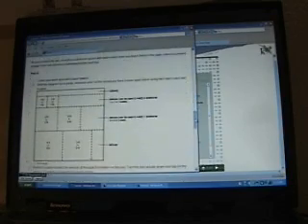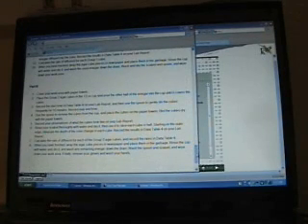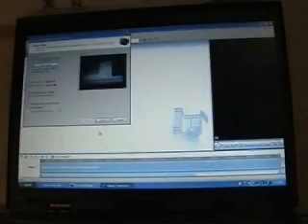And then what you're going to want to do here is access the student guide. Now the student guide is going to have all the information that you need right in one area. It's going to give you the goal for the lesson. There's the advanced prep, which you should have hopefully completed. If not, you have it printed off here. There's all the materials that you're going to need, and we're going to cover that in a minute. Safety warnings, procedures. There's the sample diagram of what your block is going to look like and how to cut it up, and then it's going to actually go over and explain what the actual experiment is. I've already printed that off, and that's where we're going to pick up right here in a second.